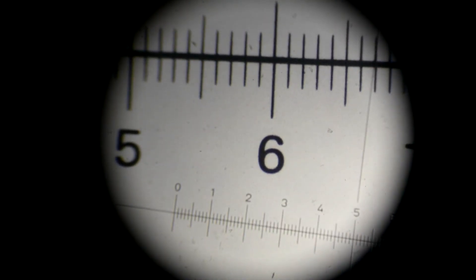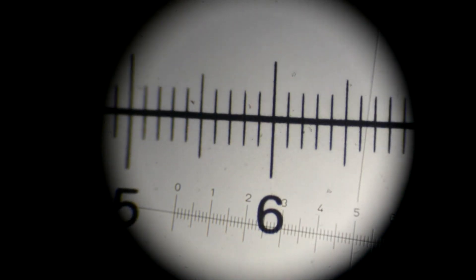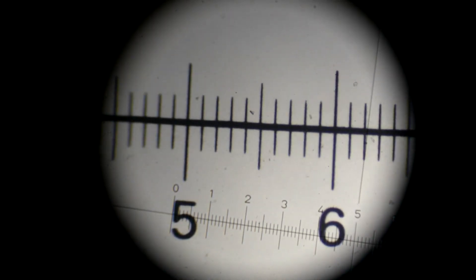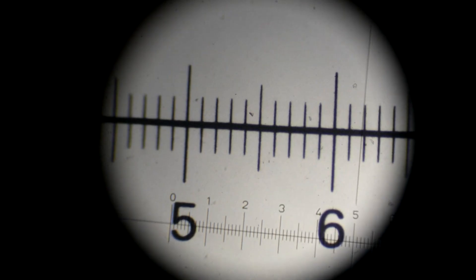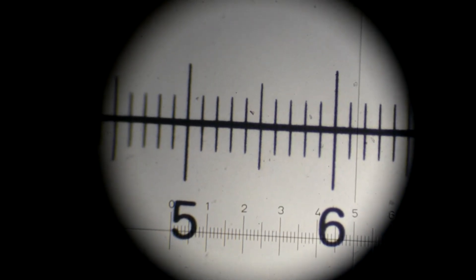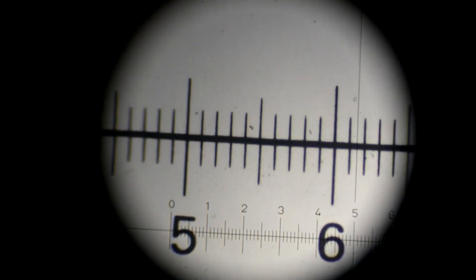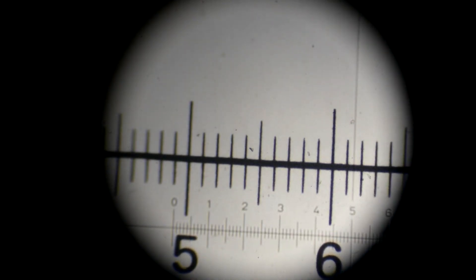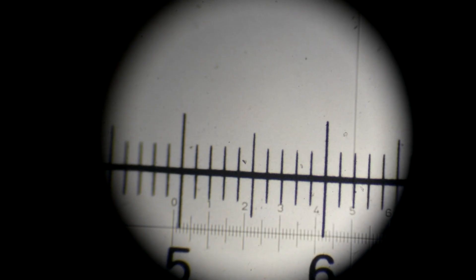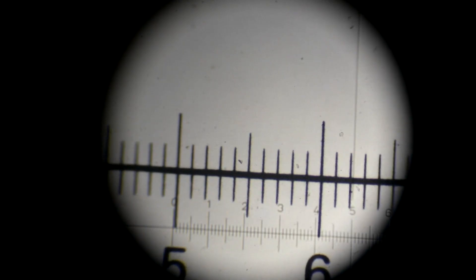Now you need to superimpose the stage micrometer with the eyepiece graticule. The larger scale that you see is the stage micrometer — you can move it up and down, right and left. The smaller scale is the eyepiece graticule, and you can rotate it.